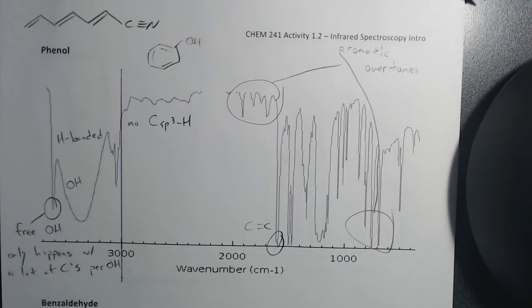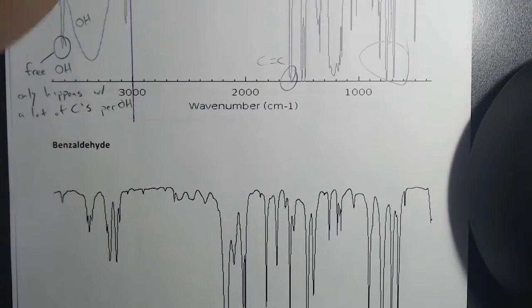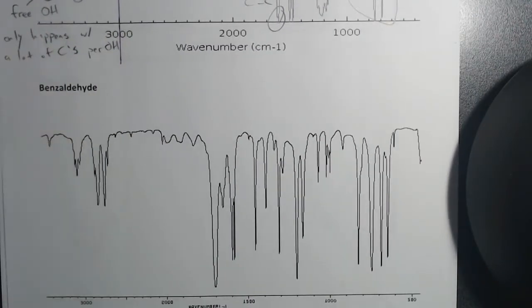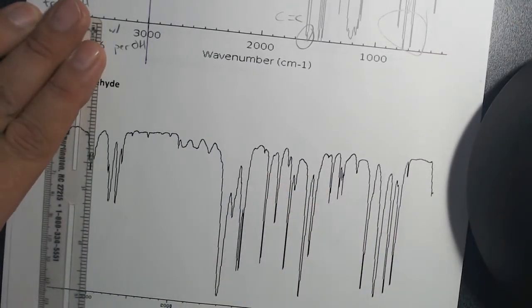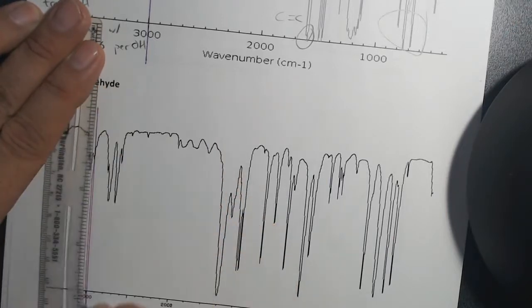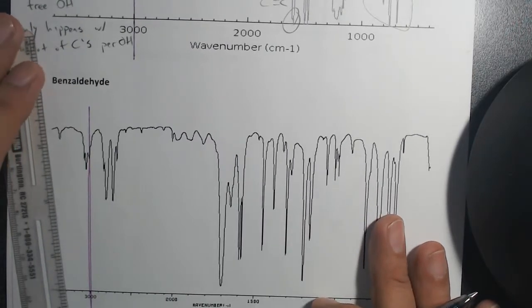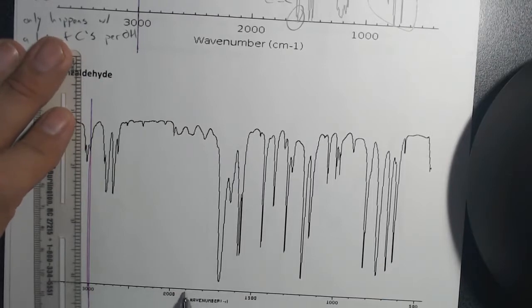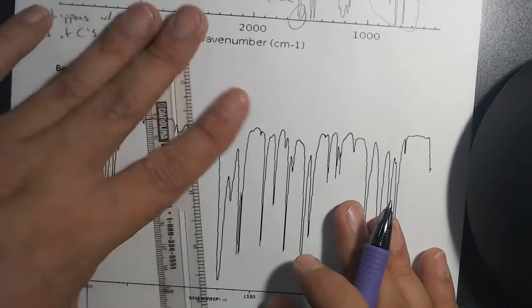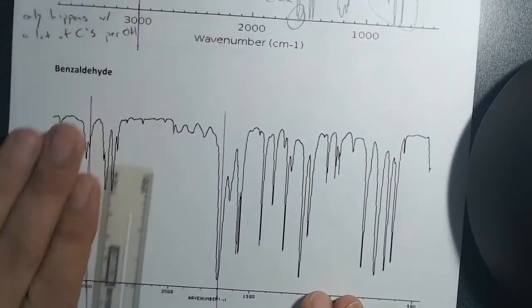All right. Let's go ahead and do a few more here. So I'm going to show you now the second line I like to draw. I like to draw a line at 3,000. The other line I like to draw is at 1,700. So 3,000. There's that. So I am already seeing a couple things here. We'll come back to that. So 19, 18, 17, so right here. Then we have that stretch that was on the quiz.